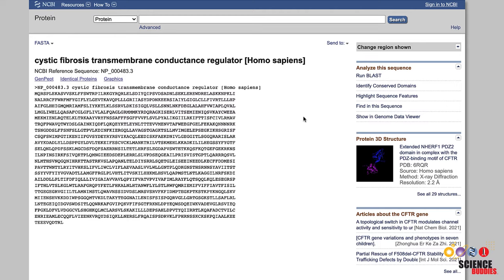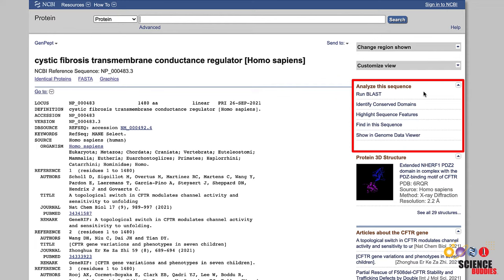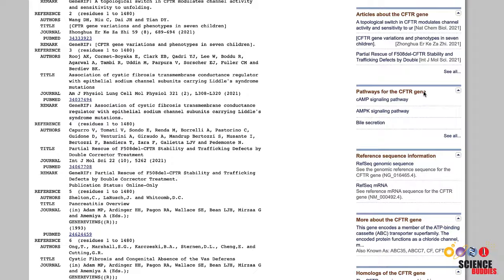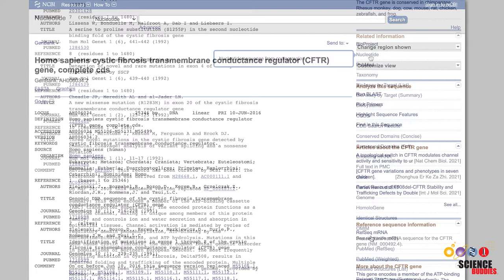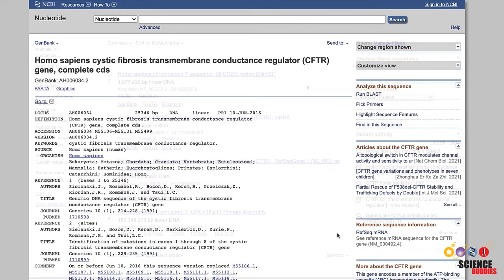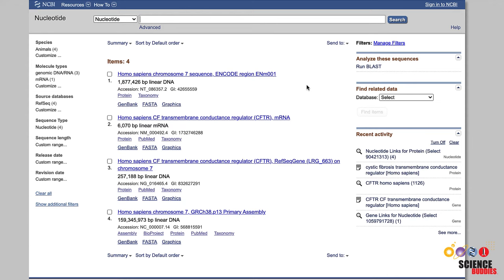Again, you can analyze the sequence with other bioinformatics tools by clicking on the corresponding links under Analyze this sequence on the right. And under Related Information, you can get to the nucleotide entry for your protein. Depending on your sequence, you will either be taken directly to the corresponding nucleotide GenBank record or you will be directed to a list of several nucleotide sequences that all correspond to your protein. The gene link will bring you to the GenBank records of related genes.